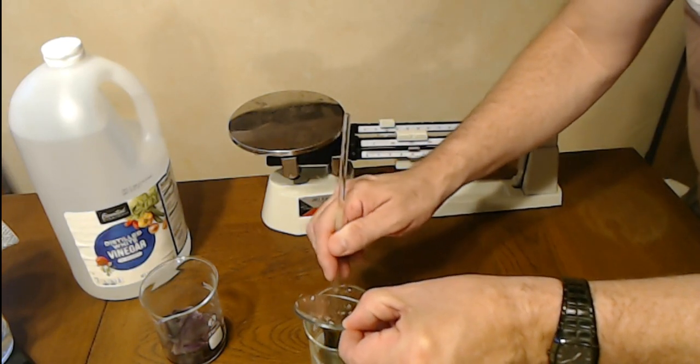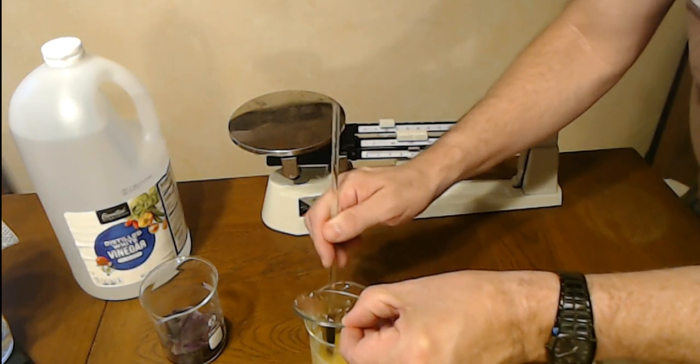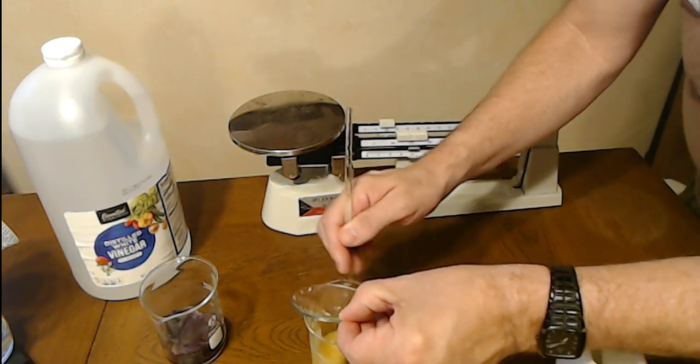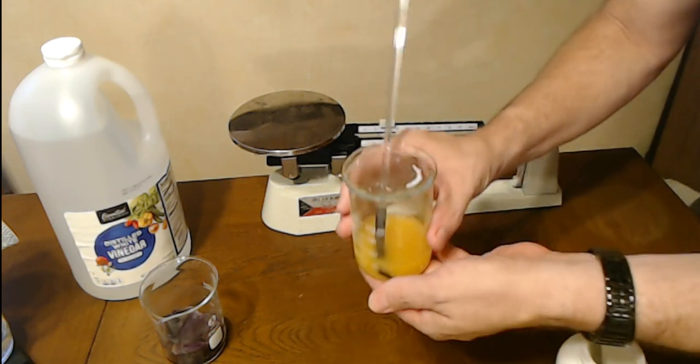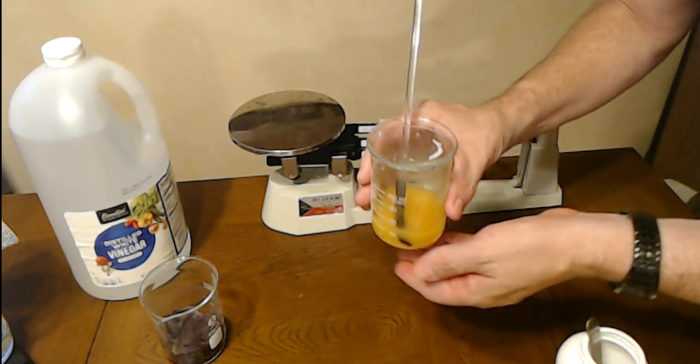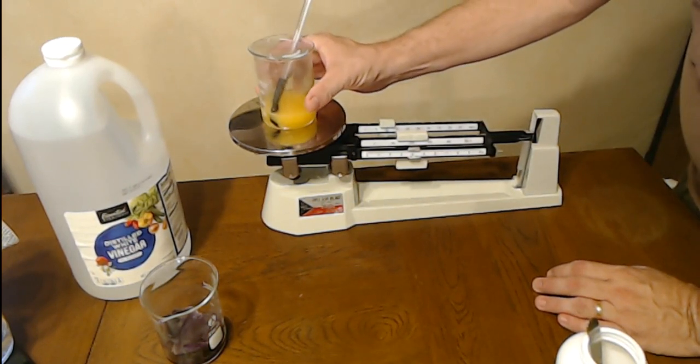Okay, so you notice a color change right off the bat, right? Went to green and now it's gone to yellow, so we're rather caustic. We have a lot more lye than we have vinegar, but we saw a change. If you do this at home, you'll feel that it's hot. This is an exothermic reaction, gives off heat. So we got our color change.